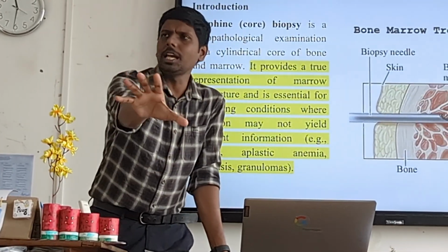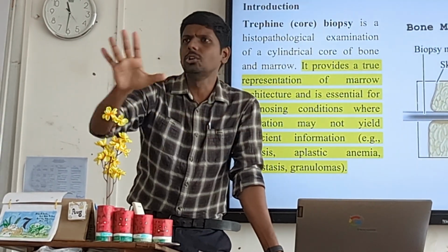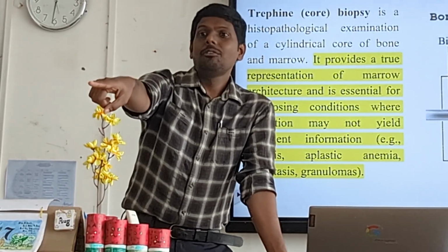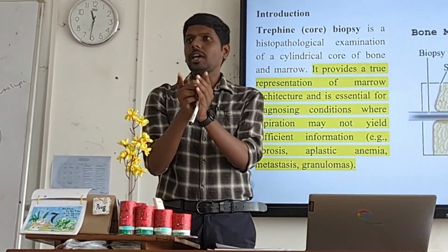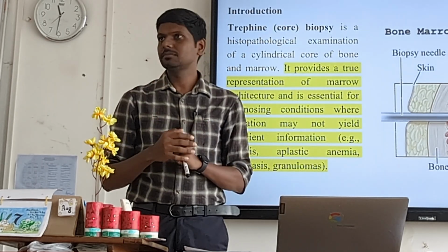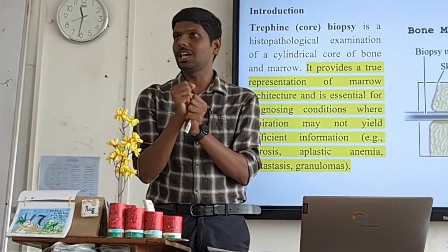Somehow we need to obtain a thin slice of cake. Why is a potato slice possible? Because potato is hard, but our cake is not hard. Now we need to identify some ways to convert soft cake into hard cake.